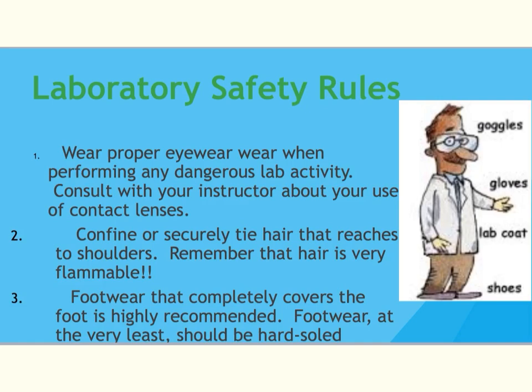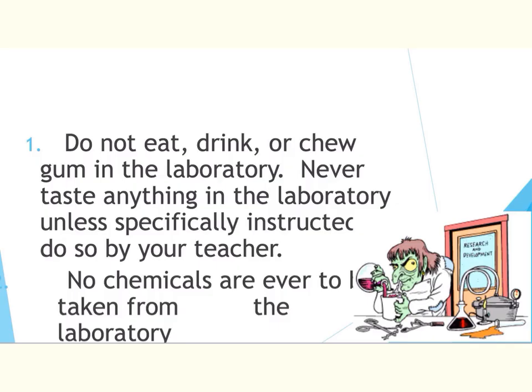You also want to pull your hair back. You do not want your hair to fall into the Bunsen burner or into the chemical, so remember to always tie your hair back. You also want to have footwear that covers the toes. We don't want to drop any kind of liquid chemical or heavy equipment on the feet, so you want solid, hard-soled shoes that cover your toes. No sandals.